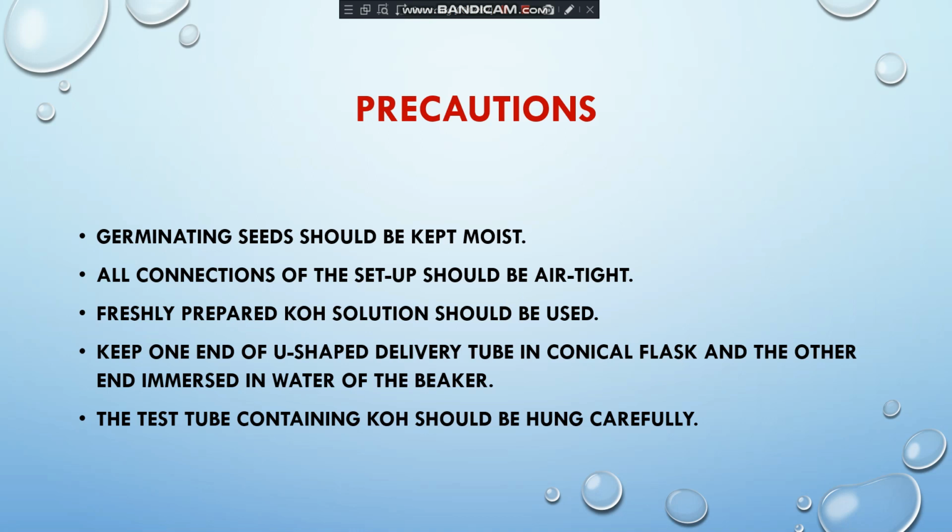The next one is that the KOH solution should be freshly prepared. It is not that you prepared the potassium hydroxide solution long back and then use it for this experiment. Then you will not get a satisfactory result.